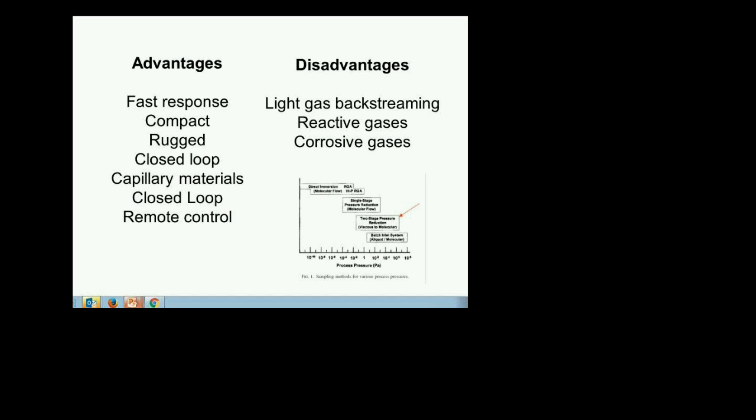But the general shape of the spectrum will not change. So even if the spectrum starts to lose sensitivity over time, and I'll tell you, even if it loses sensitivity by a factor of 10, because it gets coated, as long as your background doesn't have a lot of peaks that are going to bother you, you can continue collecting spectra. Baking out every night, cleaning it up every night, you can continue collecting spectra until you finally realize, I have nothing left here. And I do that all the time.